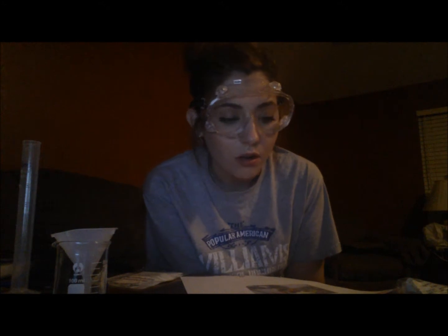I'm going to be completing the stoichiometry of a precipitation reaction. The objectives are to predict the amount of product produced in a precipitation reaction, to calculate the percent yield to determine the actual yield versus the theoretical yield, and also to accurately measure the reactants and products of the reaction. So let's go.